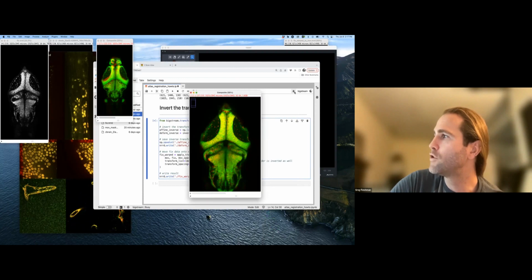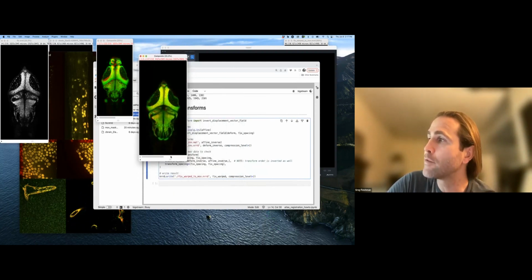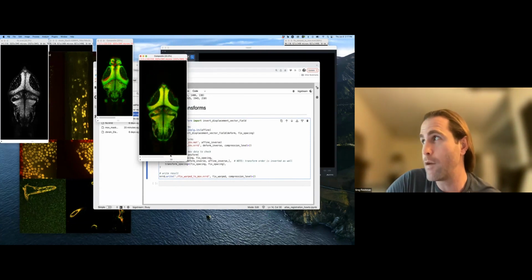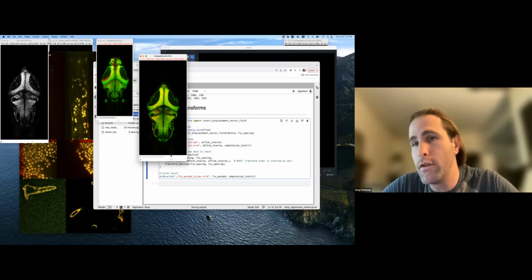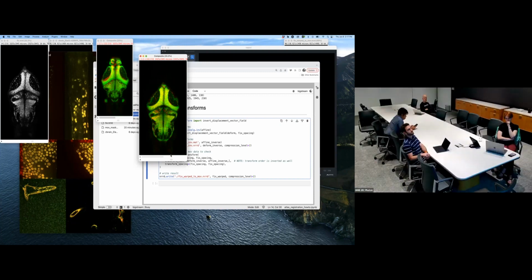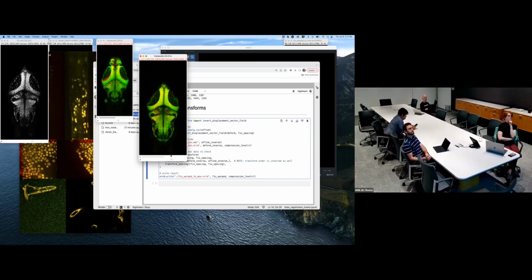So if you have two images that are registered together like this, it is impossible to recover the transform that registered the two data sets. You can look at them and say, yes, those images look nicely registered. But if you want to use that registration result to do any of the other things I discussed, like moving objects back and forth between the two spaces, or even just study the transform itself in order to learn how the shapes of the two different objects were different, that's all contained in the transform, not in the image data itself.